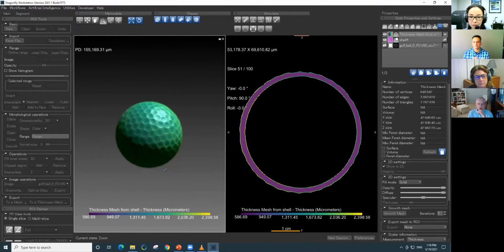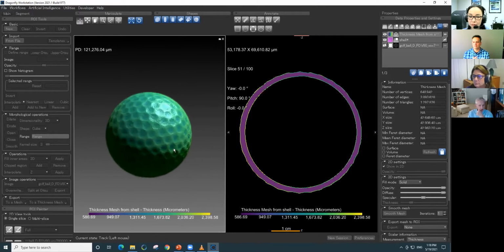But to the rest of the question, can you control the level of resolution? What you can do after you compute a mesh is decimate the mesh. So if your tessellated surface mesh is millions of polyhedra and you need to have it smaller so it's more manageable, you could set a decimation to target a few 100,000 polyhedra or a few 100,000 triangles instead.